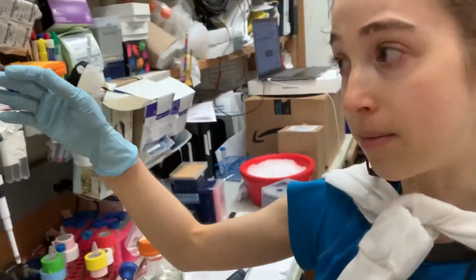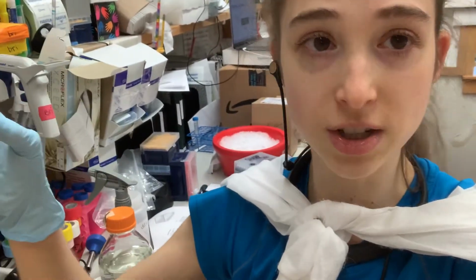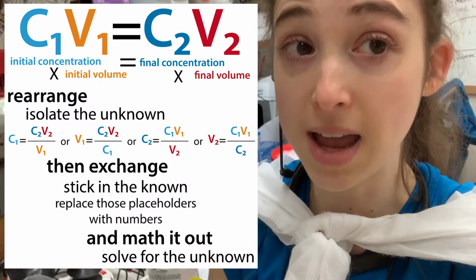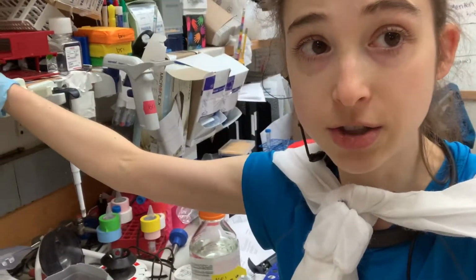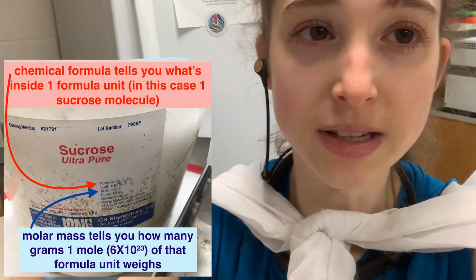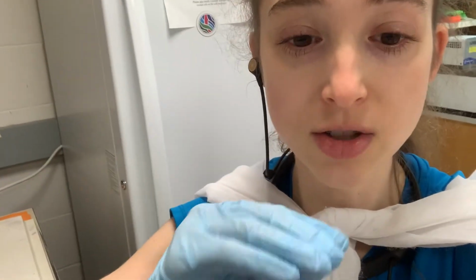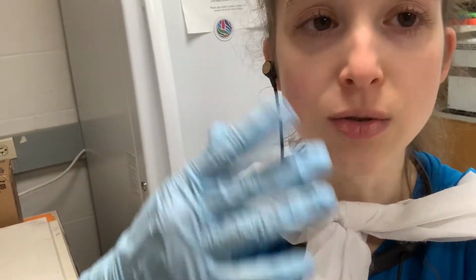It's a lot easier to make solutions when you just have to add these liquid components, and you can easily calculate how much of the various components to add using that C1V1 that I've talked about. You have to start with the solid though to actually make these stock solutions. And so when we do this, we're going to rely on the molecular weight or the formula weight. The formula weight is going to be the weight of a mole of those things. So if you wanted a 1 molar solution, you need to weigh out 1 mole's worth. And to know what 1 mole's worth is, you look at the label.